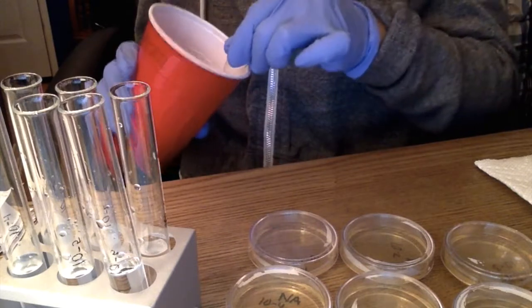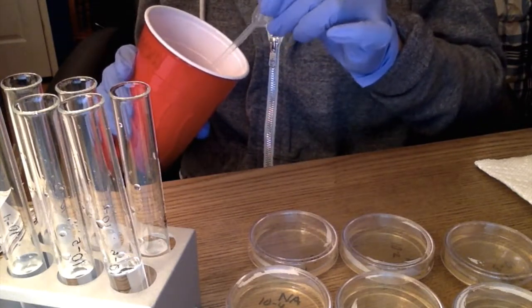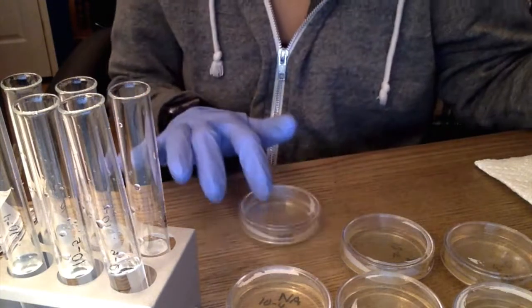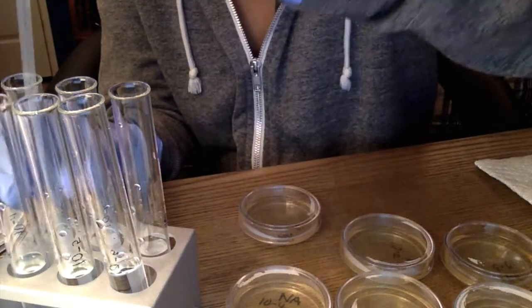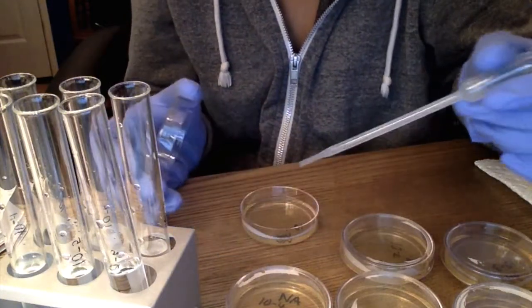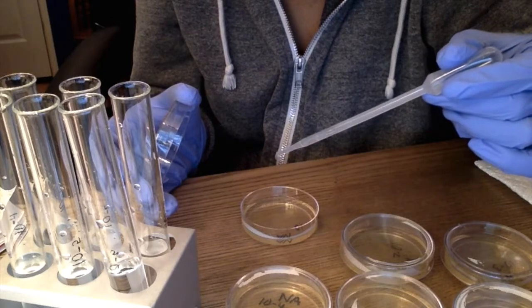the plates. So I'll be putting 0.125 milliliters, which is also equivalent to 4 drops of the tube solution, into the corresponding agar plates. So here I have the agar plate 10^-1. I'm going to get enough of this solution. So like I said, it's about 4 drops. So we've got 1, 2, 3, 4.